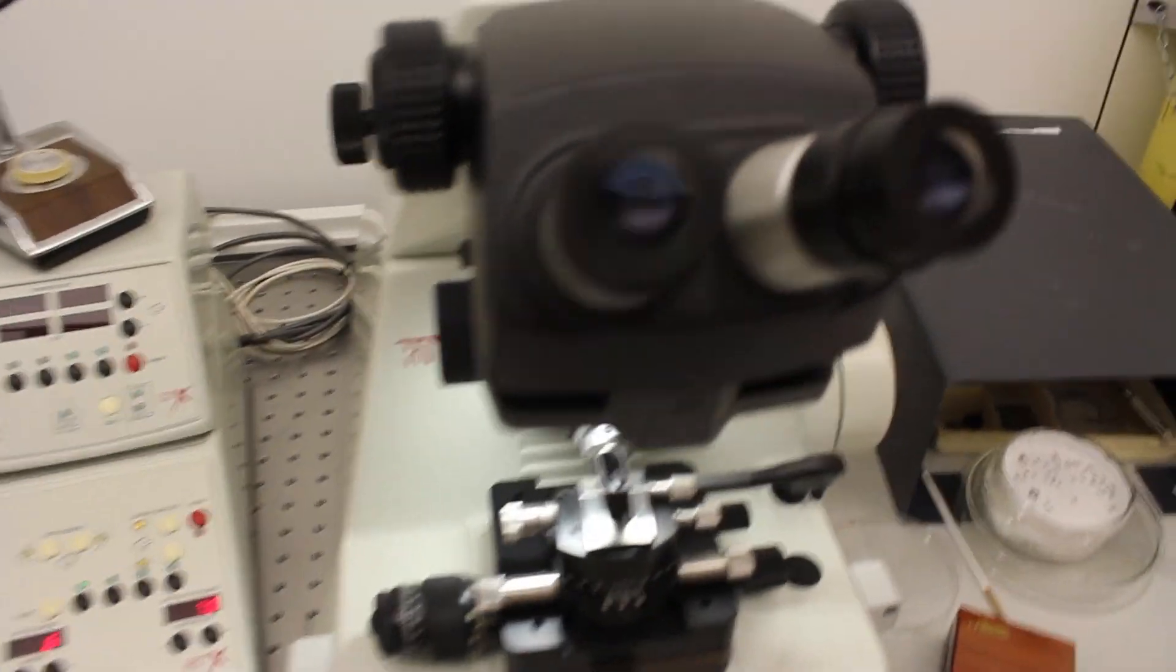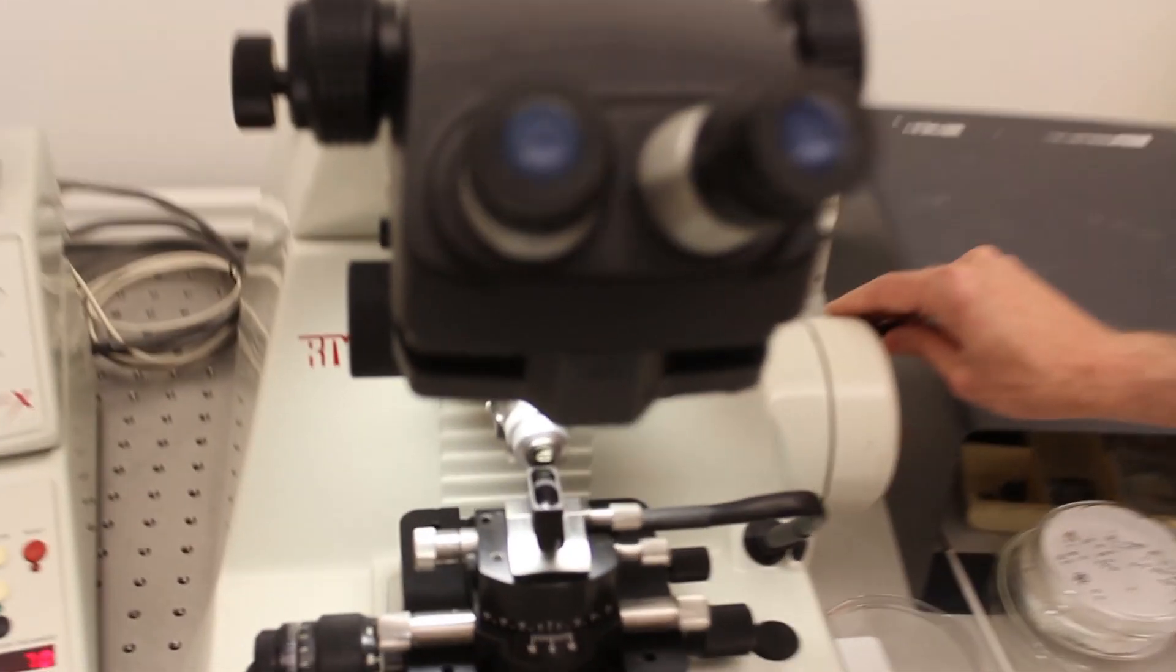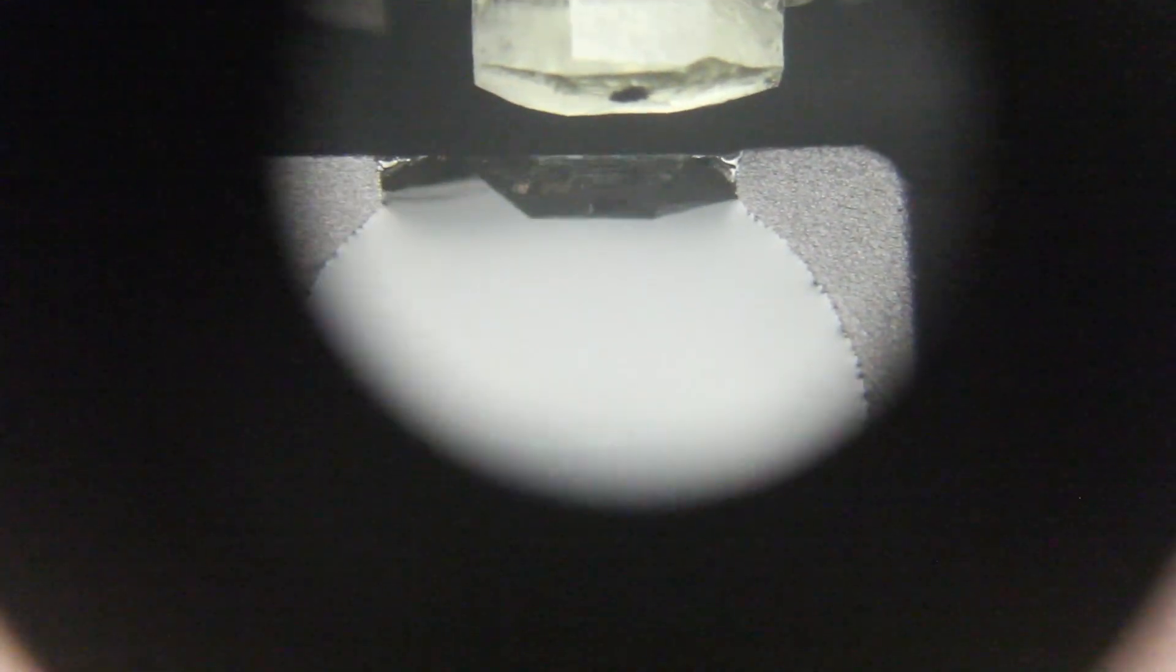So, okay, I can actually see. You can see that? Yes, I can see what's good. All right, so we're going to look. Okay, I can actually see it. So the sample gets cut by the knife. I've got it set back so that it's not actually cutting. So that's a diamond blade that I'm looking at.